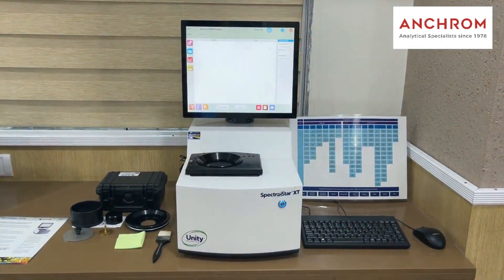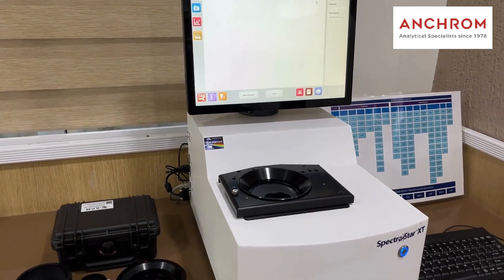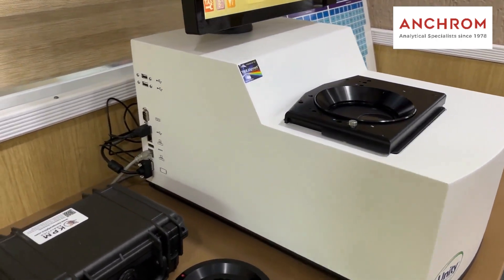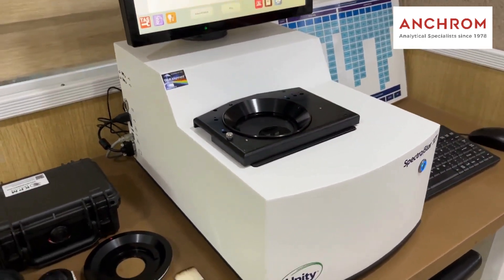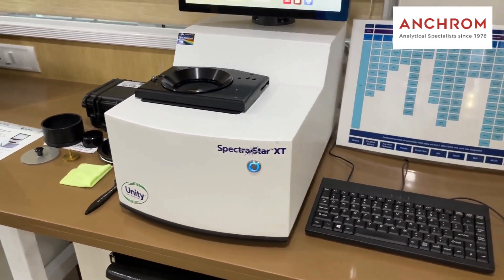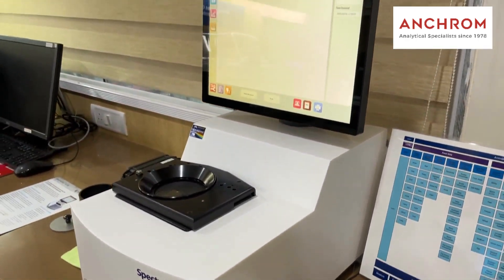The SpectraStar NIR analyzer is a compact unit with an attached computer. Its portability allows you to take it to production sites, labs, or wherever you need it. Unlike other instruments, it's a closed unit with no fan or ventilation, ensuring a dust-free environment. Additionally, it's designed to be vibration-proof, adding to its durability.